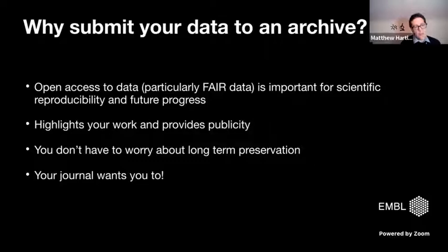There are other reasons, though, one of which is that it requires a lot of time, resources, and skill to produce imaging data. And publishing the data, even independently of the scientific results, highlights that. It gives publicity to your data, independent perhaps of the manuscript, and that can be quite valuable, particularly to demonstrate when there are new techniques, and what you actually want to do is give people access to the data as soon as possible.